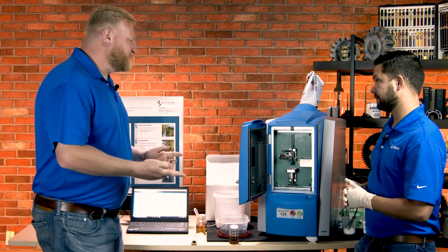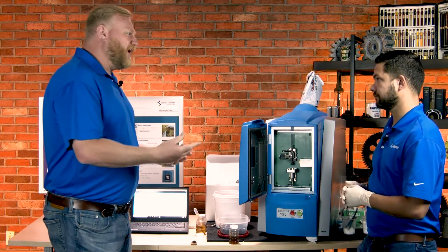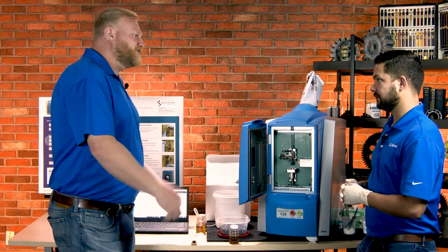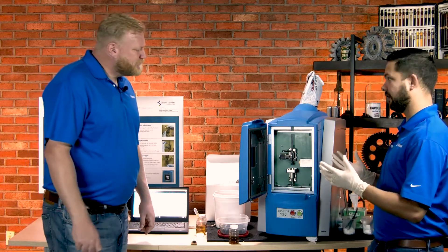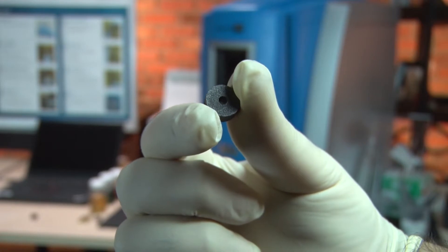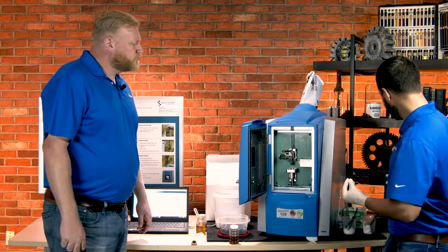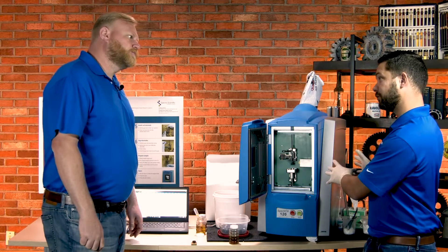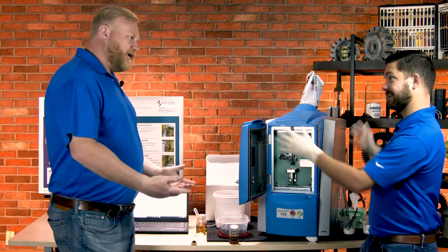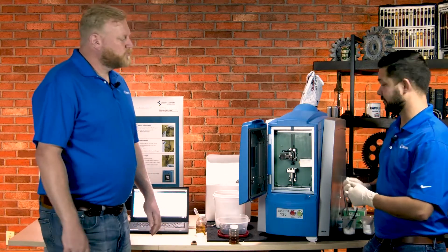We've got a lot of different components here — do all these come with the product, and does it work well with other oil analysis technology? Everything you see here is just out of the box. They provide all the things you need, including the electrodes, containers to hold the oil for the sample tray, and even a sharpener to sharpen the rod to a point. It's all included. This will also connect to other oil analysis instruments provided by Spectro — you can create a whole mini-lab setup that works together to provide a big picture of the oil analysis.